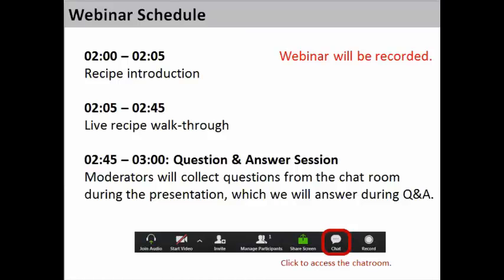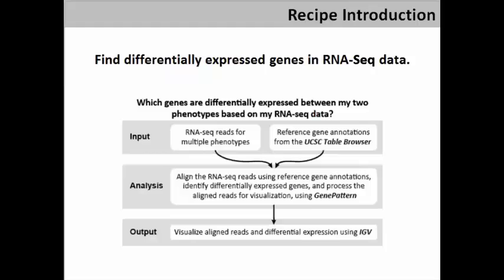The recipe we will cover today answers questions such as, which genes are differentially expressed between my two phenotypes based on my RNA-Seq data?